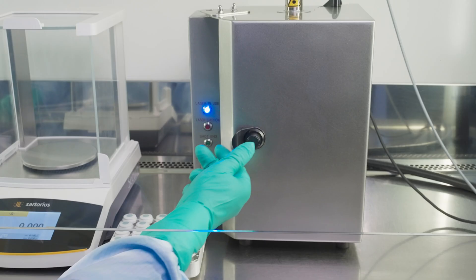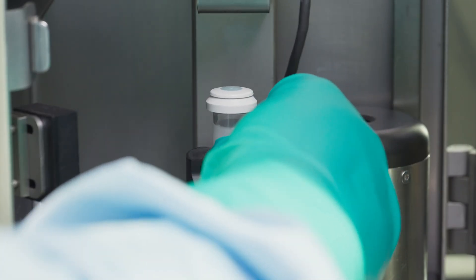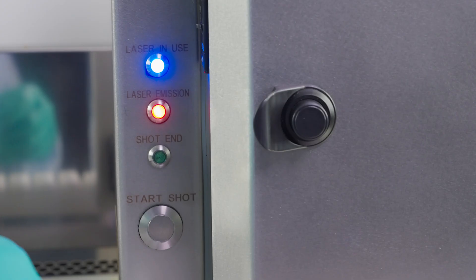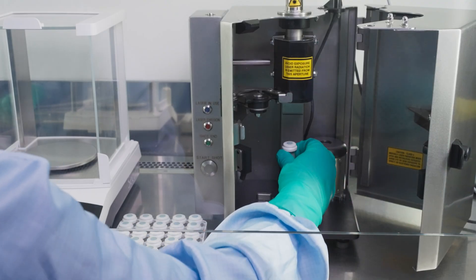The next step is the laser resealing. Just a one-second laser shot will be enough to restore the container closure integrity of the filled vial without any impact on the product.